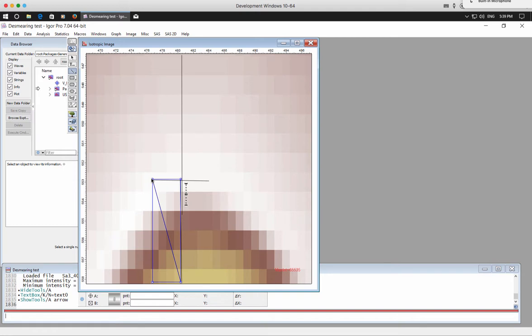It is expressed in Q units, and it's typically fixed for a given instrument. And that is what is used for smearing of the data. So it's kind of a rolling average. Now, what is its impact and how do we remove it?